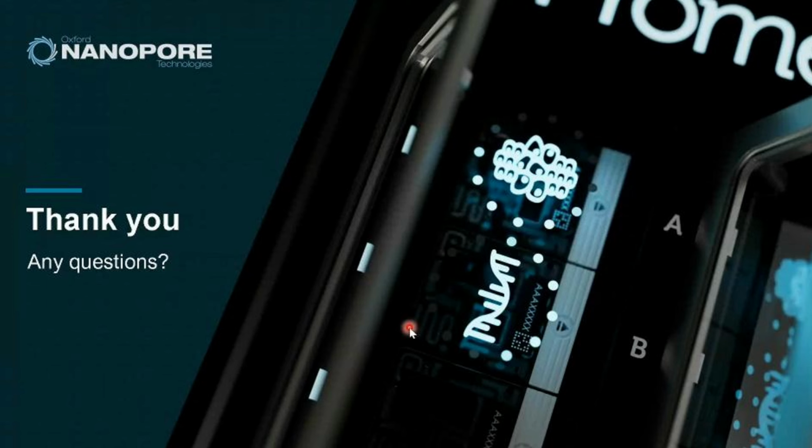I think I can share another interesting piece of research that I came across as well. Just now we mentioned guts. We have another interesting study from one of our researchers. Basically, they study the gut of fish, but they are not looking at the microbes, but at what kind of fish, what these big fish are eating, those small fish. So we amplify the gut content to see what kind of fish is being eaten by this large fish.